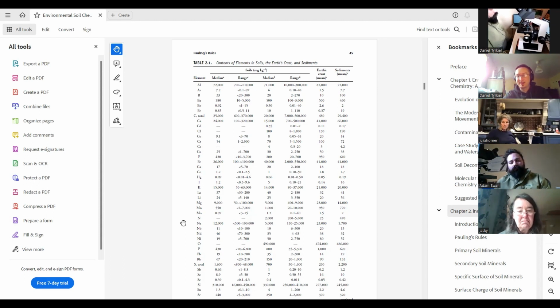So this is where having a healthy soil food web, where you've got free-living nitrogen fixers and fungi working together, is important. There's a couple of interesting papers that nobody really talks about.